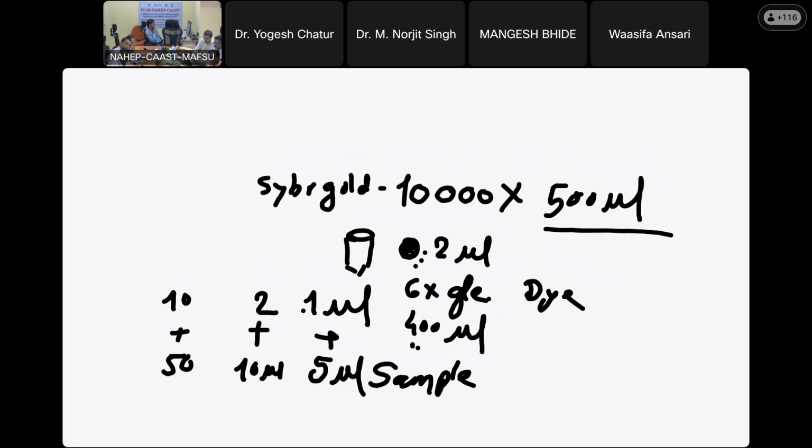With blue light you don't need to have a shield. With the naked eye you can see it. The only thing you have to purchase is orange color goggles, and through orange you will see very nice bands. So at the end, it's a cheaper version, a safer version.